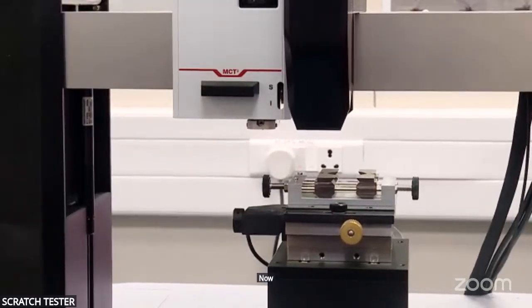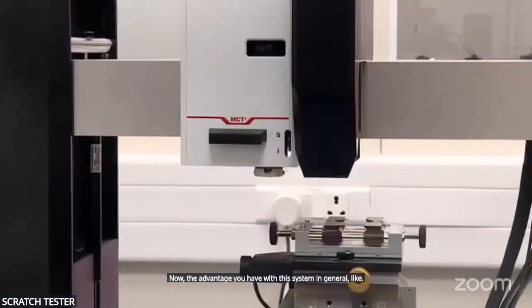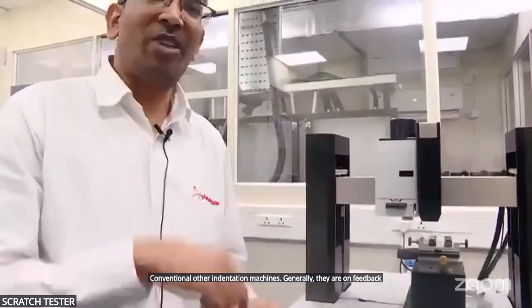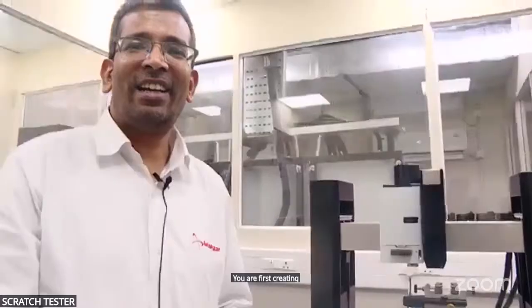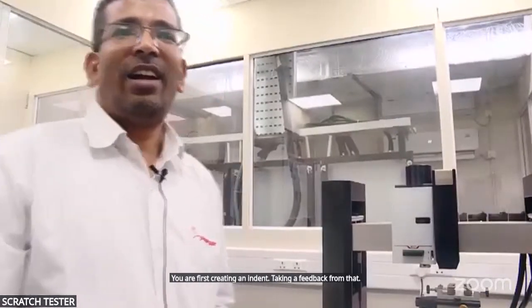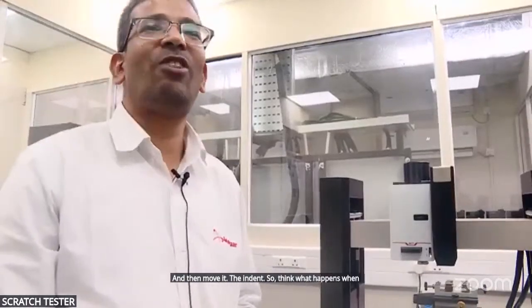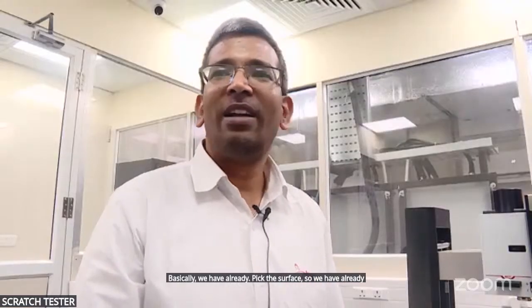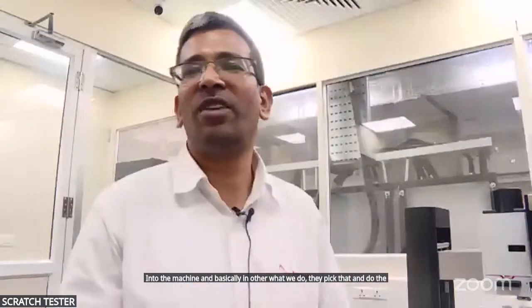Now the advantage you have with this system, in general, unlike conventional indentation machines, is that those generally work on a feedback loop. You first create an indent, take feedback from that, and then move on. So think about what happens when you make an indent to detect the surface itself. Basically we have already pricked the surface, so we have already done some damage to the surface which we don't want, because that will act into the machine, and in the others they pick that up and do the correction via software.